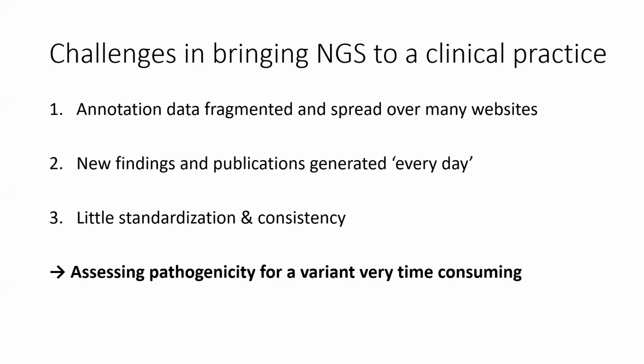Obviously, there are many challenges in bringing NGS technology to clinical practice. However, from our perspective as a bioinformatics company, we are focusing on 3 challenges in particular. Challenge number 1 is the fact that annotation data are fragmented and spread over many data resources.